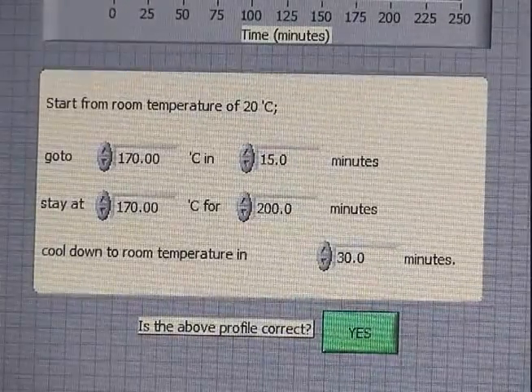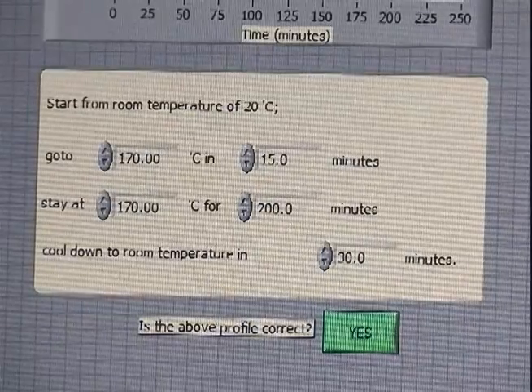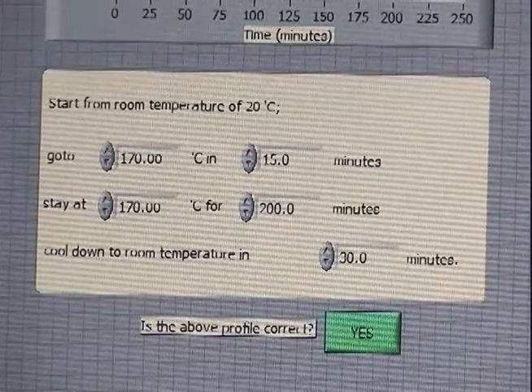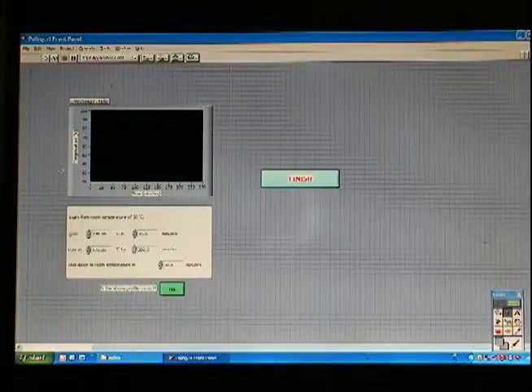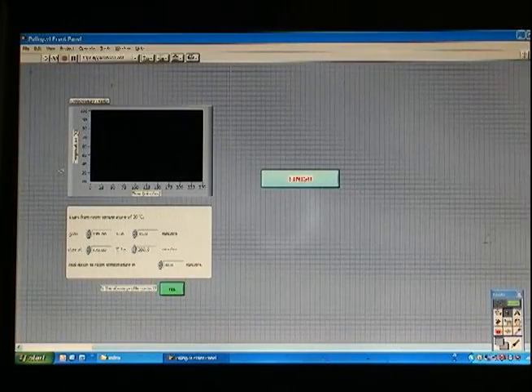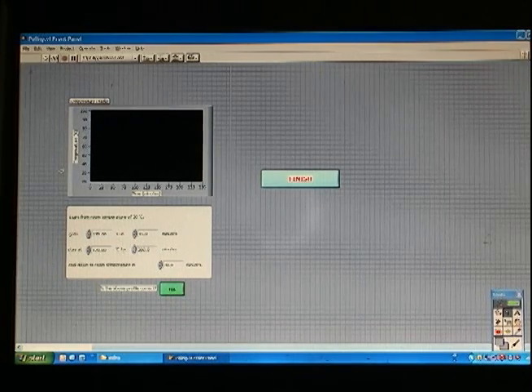We tend to try for every ten degrees Celsius to take about one minute, so if you're trying to get to about 150 Celsius, then you need about 15 minutes to do so. Once you've selected these things, you can start and finish your selections, and then the machine will begin to increase the temperature.